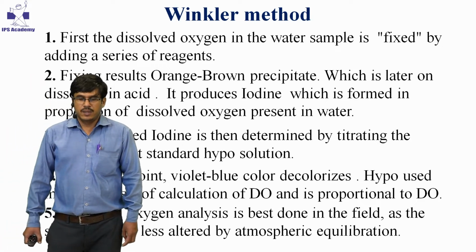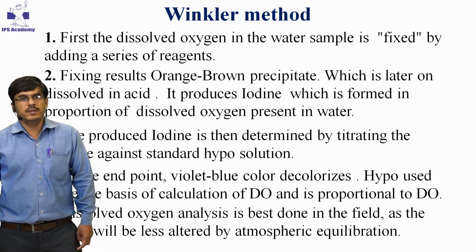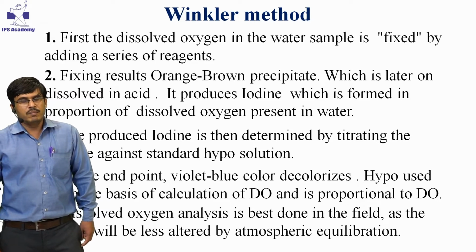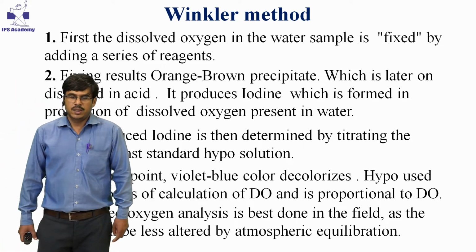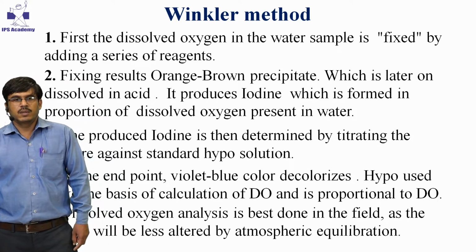So first, take the water sample in BOD bottles, and then we add some reagent to fix the dissolved oxygen, so that the amount of dissolved oxygen remains fixed.